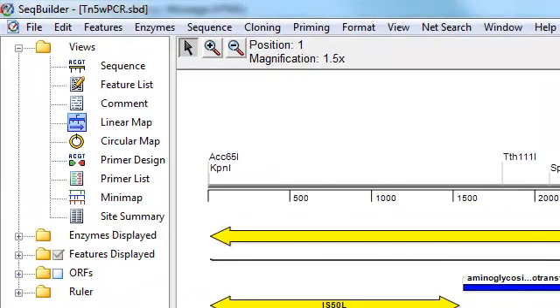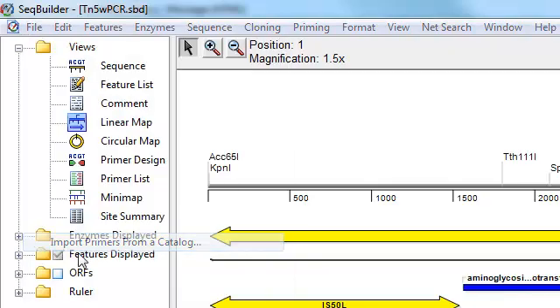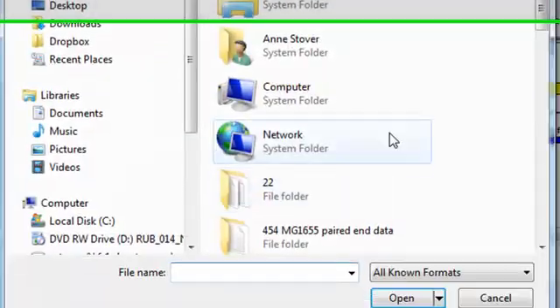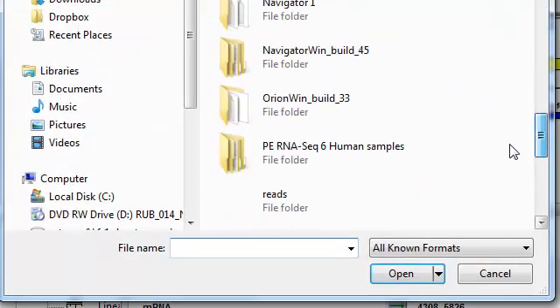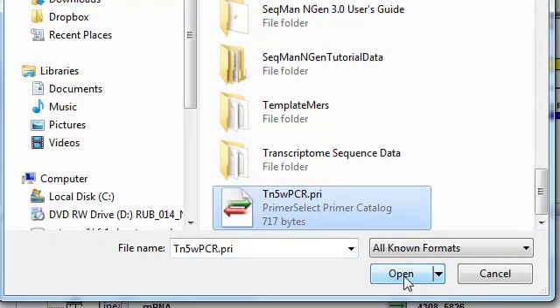So to import one of these into your project, just select File, Import Primers from a Catalog, and then navigate to your Primer Catalog file.